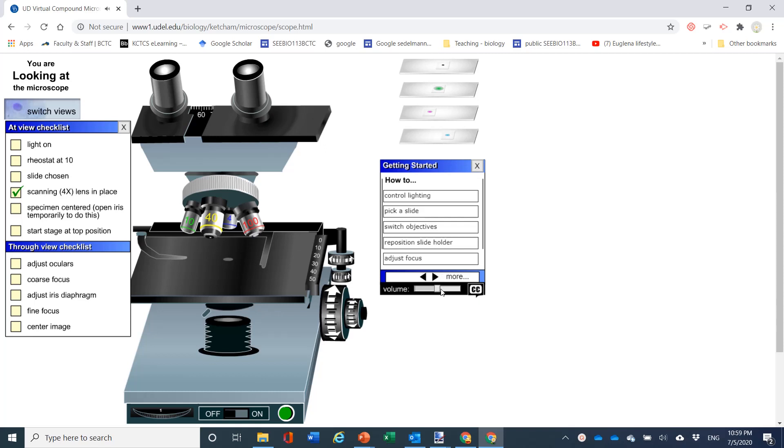The checklist will help you keep track of steps you have completed. First, turn on the light. Click here to learn how to do this.